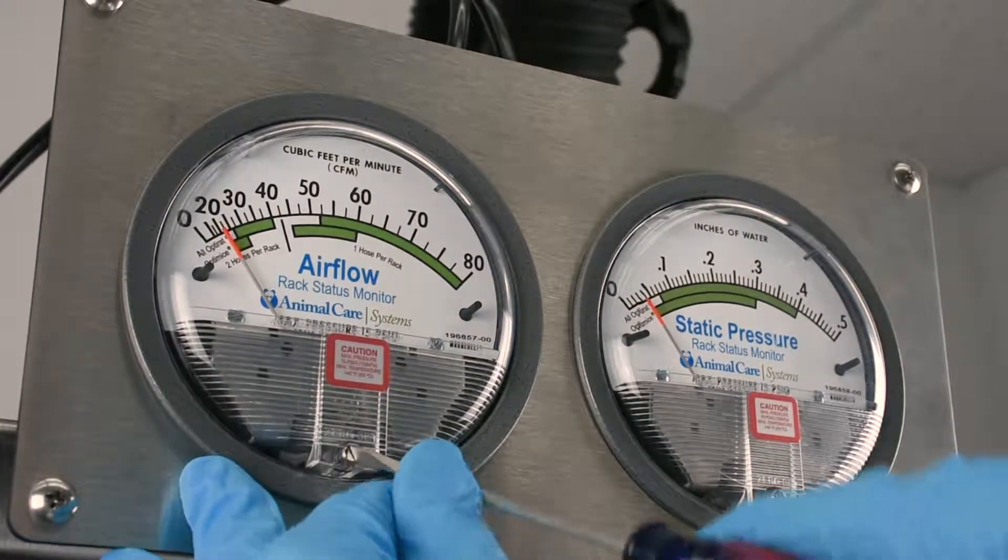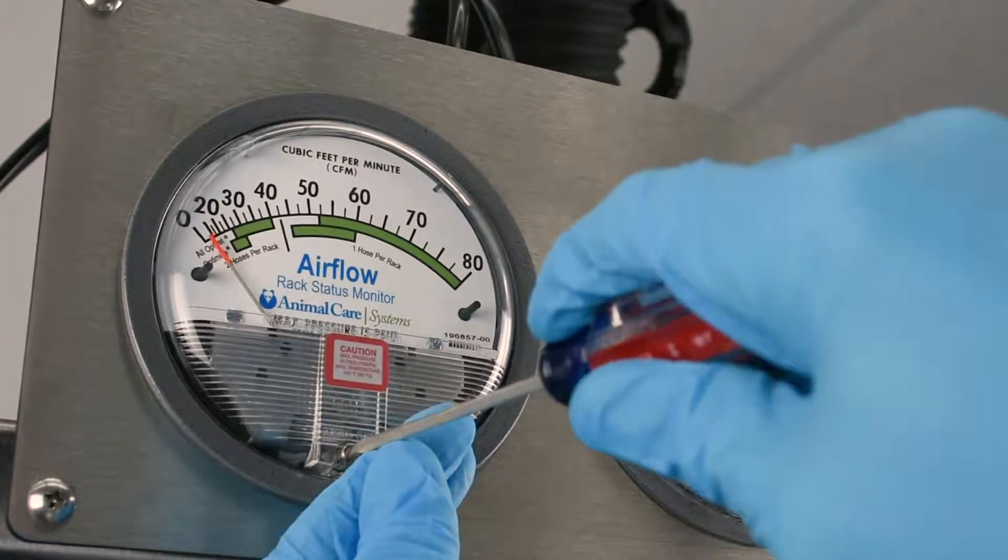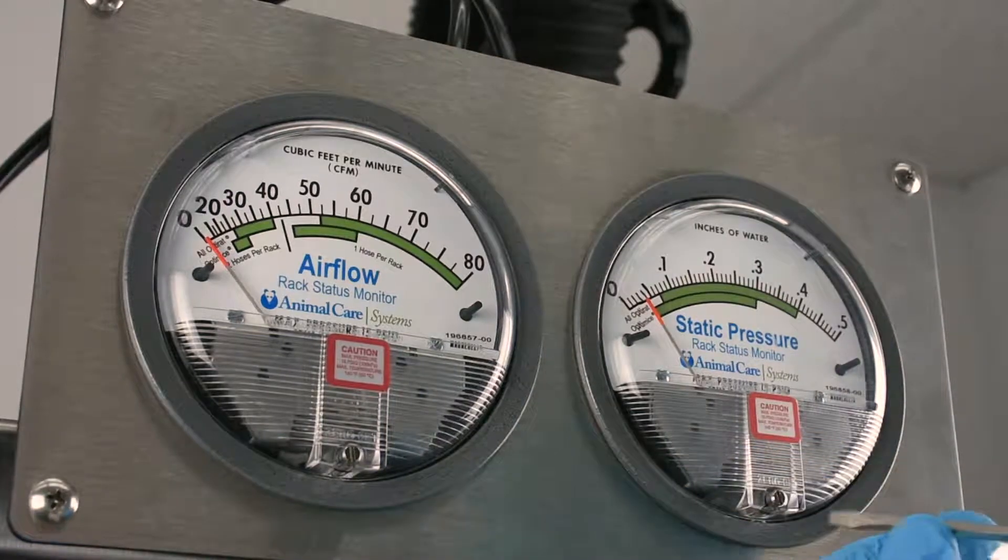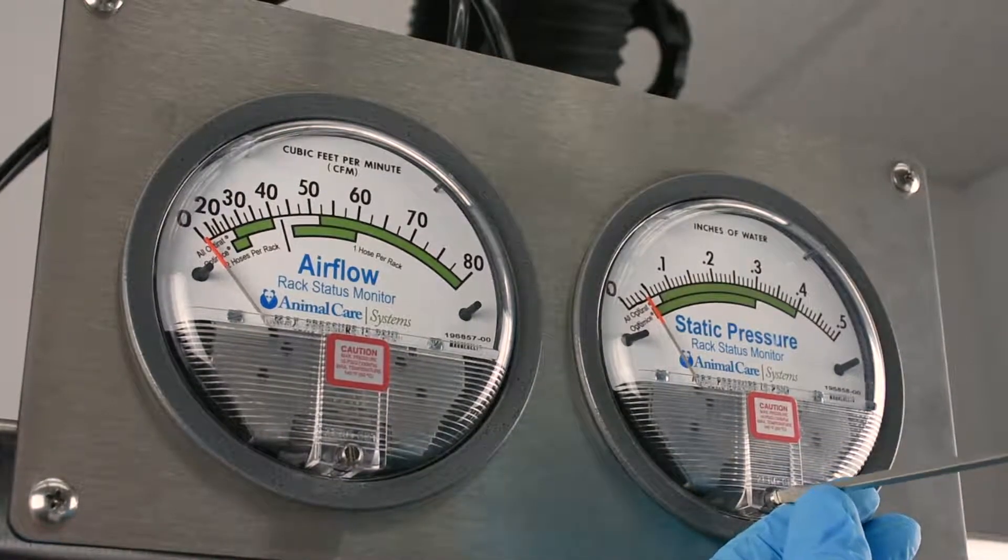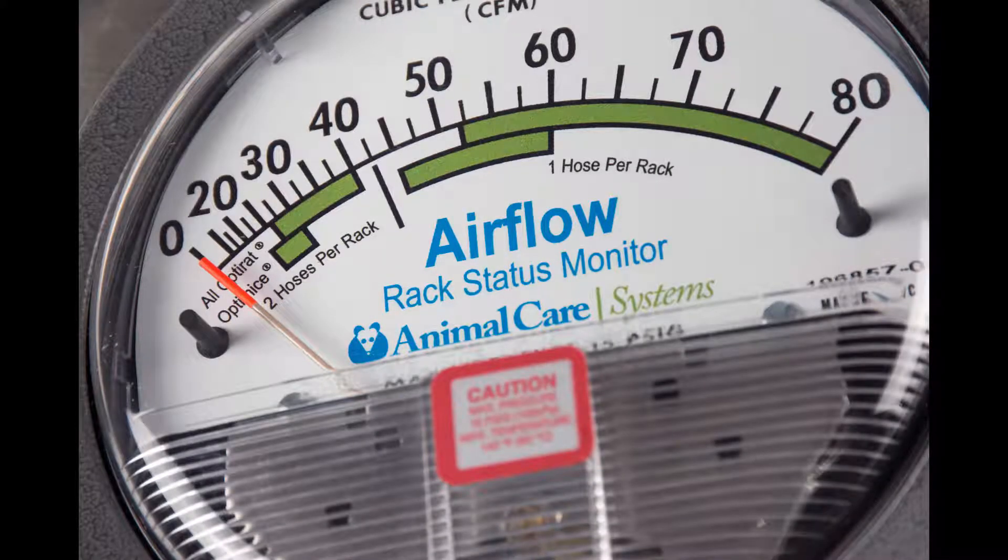Zero the gauges using a small flat head screwdriver by turning it counterclockwise. If the needle is to the left of zero, turn the screw clockwise for fine tuning. Take an appropriate angle for precise zeroing. Follow the information on the gauge faces carefully. Stay within the green parameters for the specified setup.